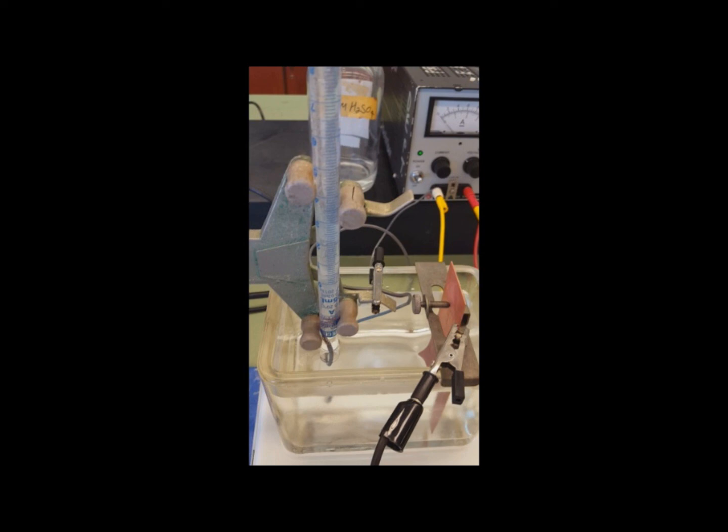This experiment gave close to theoretical results. They were very good, meaning that there really are no other reactions competing. In other words, at the copper plate anode, we didn't have interference from the oxidation of water to oxygen. Likewise, at the copper wire cathode, we didn't have the reduction of water. We only had the reduction of H+, and so it worked out quite well.